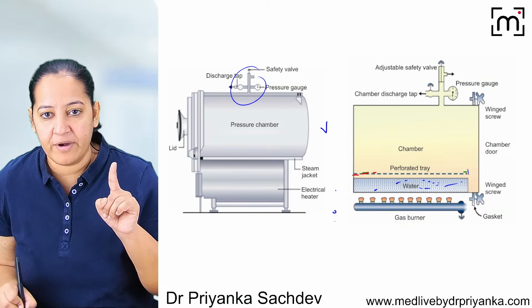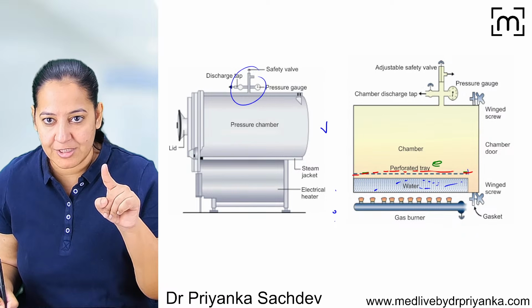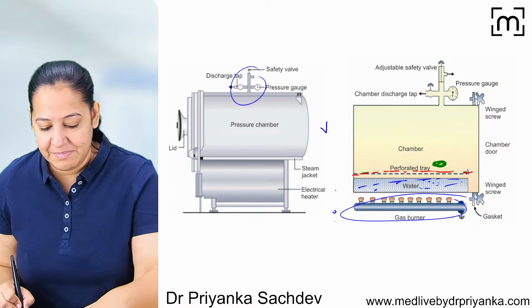You can see it's a perforated tray. And this is my article. I have put my article on this perforation. And it is filled with water. You can see this is filled with water. I'm heating it on a gas burner. So you can see the steam is generated.